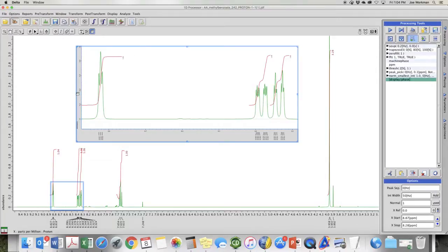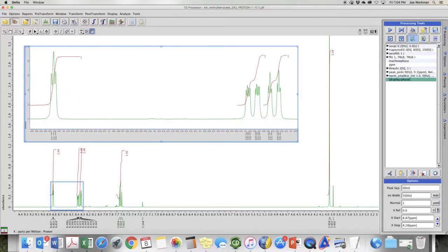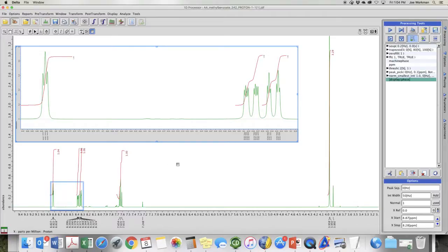I'm going to make it a little bit wider here. I could have drawn a picture-in-picture for just this signal and for just these 2 signals if I wanted to. The y-axis here is not necessary. So if you press Option Y, I'm using a Mac keyboard, you can get rid of that.